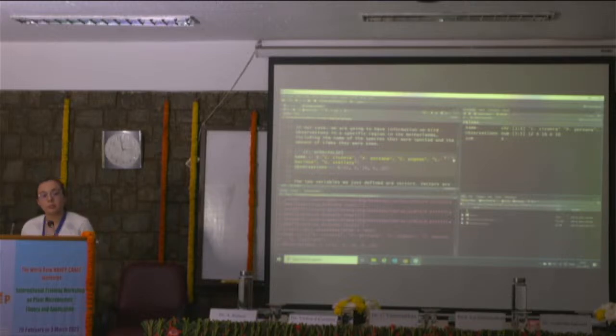So maybe you can try to do the following. In the console, why don't you type name, enter, and see what you get?